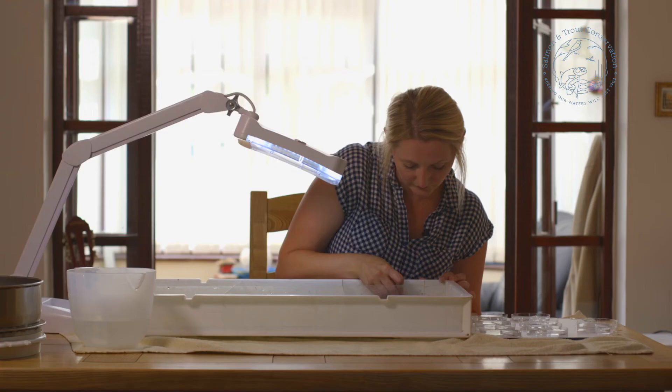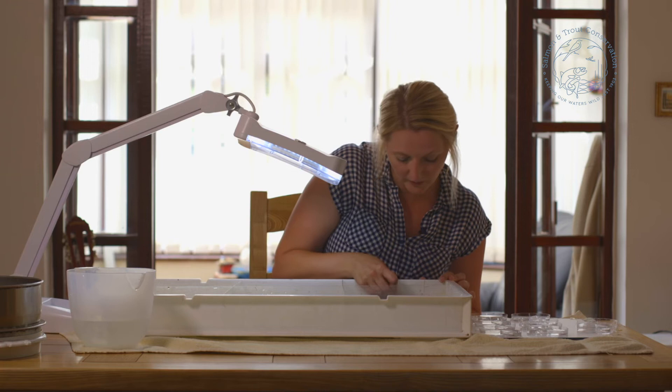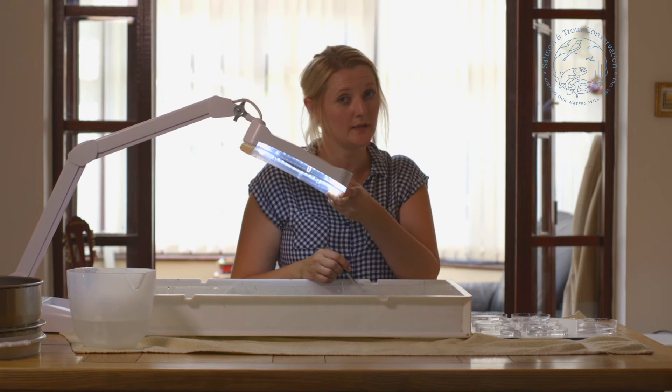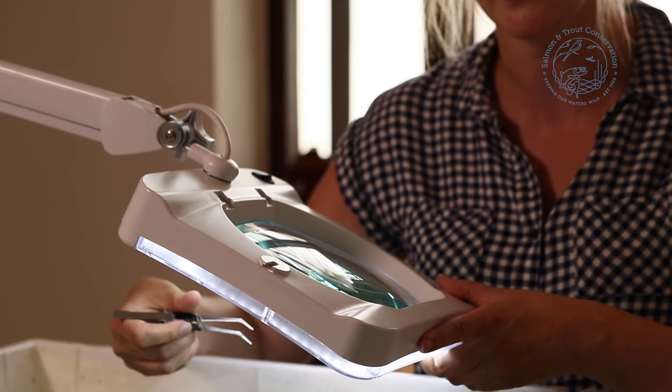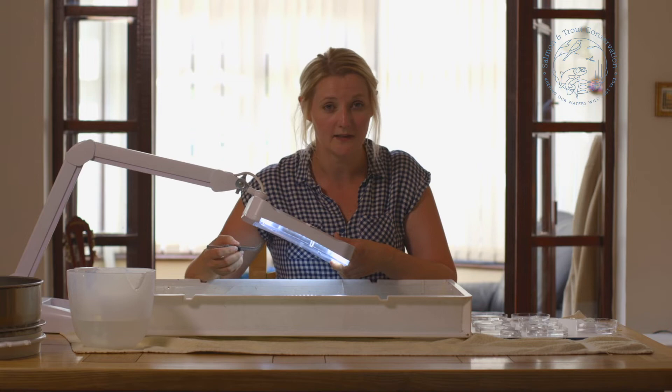Once I've gone through all of my sample, I'll bring in the magnifier. You might use this for the whole sample depending on your eyes. The magnifier means I can get extra magnification. There are certain caddis that are smaller and flatworms that you might find in your sample that you wouldn't necessarily see with the naked eye. Things that even professionals miss. So it is important that you do go through with the magnifier to make sure you've got all the different animals inside your sample.